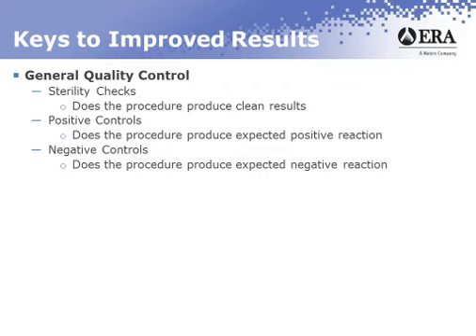either turbidity with no gas production, an atypical colony, something along that line. Some of the negative cultures that ERA uses in some of their products are Pseudomonas species. Generally fairly good for most of the various wastewater methods that are out there. But again, you want to use something that's appropriate for the method that you're using. And again, it could be a single-use preparation, or it could be something that you maintain as a stock culture. But the key is that you need to maintain the purity and the viability of it. You don't want that organism changing over time and giving you a false reading of some sort.